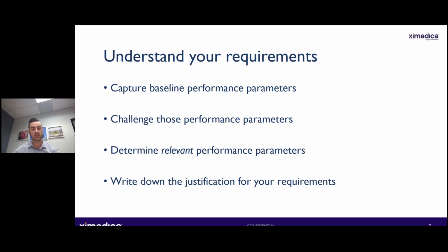So, rather than just taking some of these requirements as given, translate what does 5% CV mean in real terms of volume delivered. You can be surprised about where you can flex and relax some of your requirements a small bit. That can again give you more options when you're choosing certain elements of your hardware, but capturing these justifications is also a really good way to facilitate efficient communication between your assay development team and your hardware development team. And again, that can just streamline your development cycle.